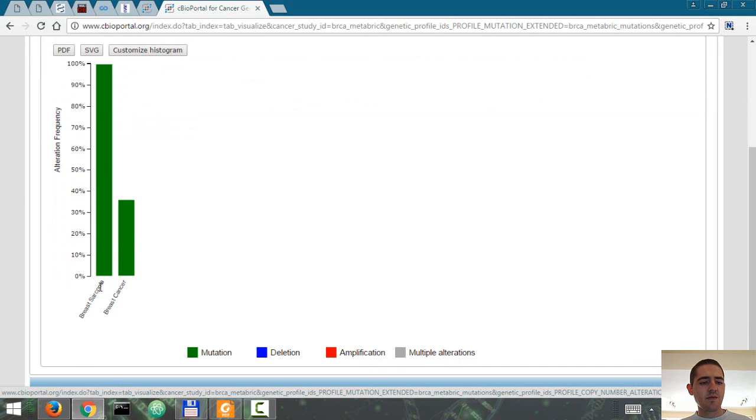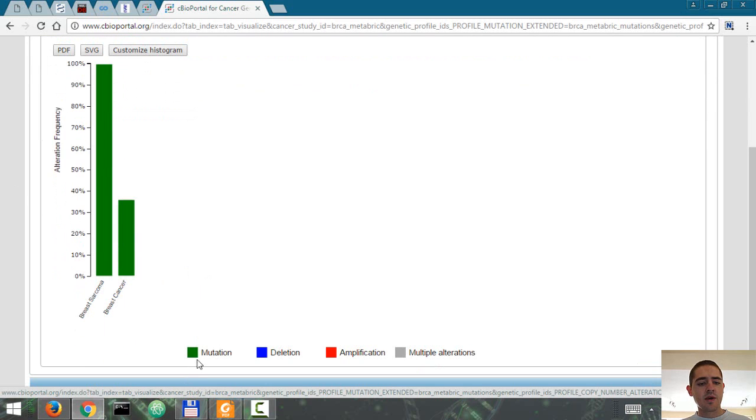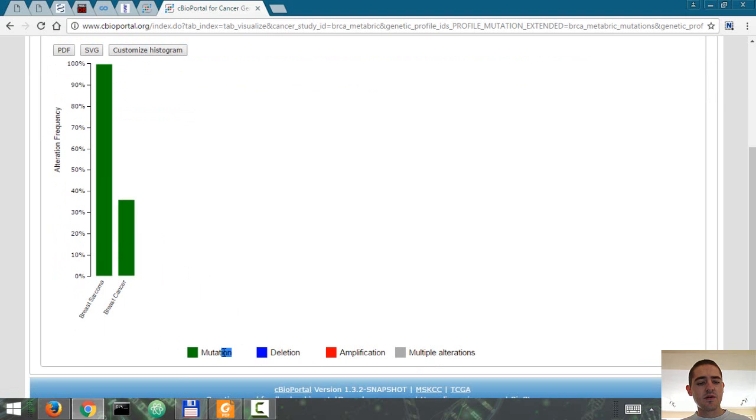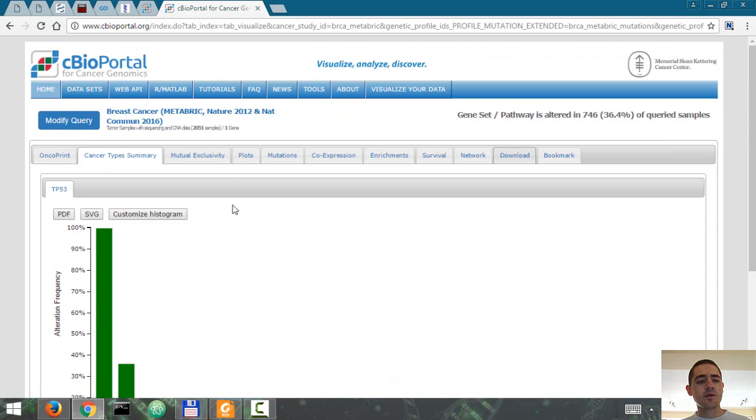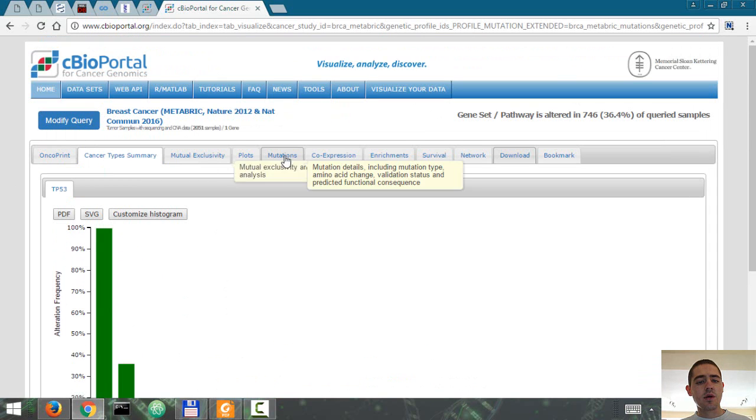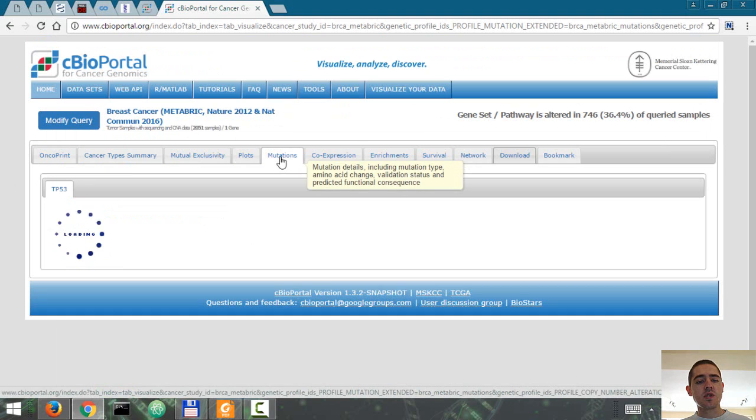The type of cancer. This refers only to the mutation, not the copy number alterations. Let's look at mutations.